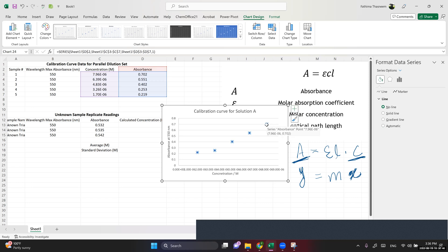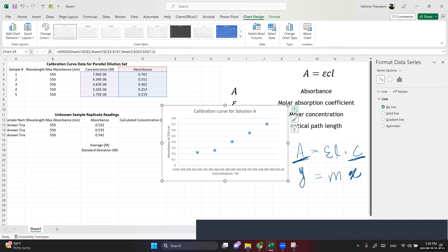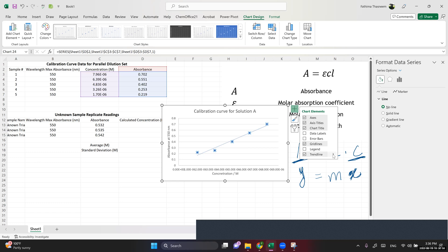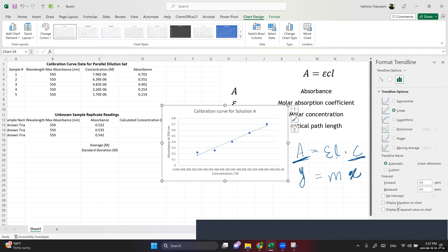You can also add a trend line. Right-click on the data points and go to Add Trendline, or click the plus button on the chart. Go to More Options, scroll down, and check 'Display Equation' and 'R-squared.' The R-squared value tells you how well the data points are fitted to the line.